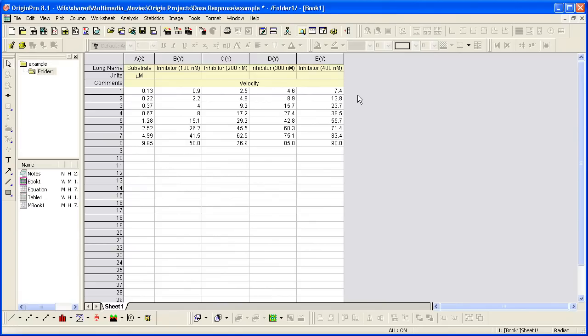Origin provides built-in dose-response fitting functions, and in this tutorial, I will also show you how to compute EC50 or IC50 using what is called derived parameters.